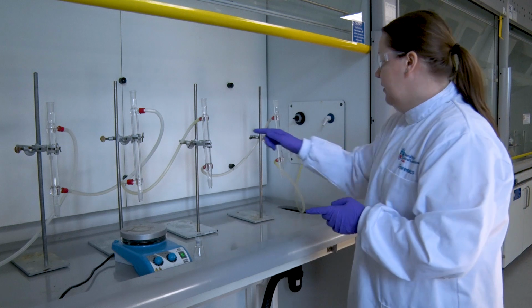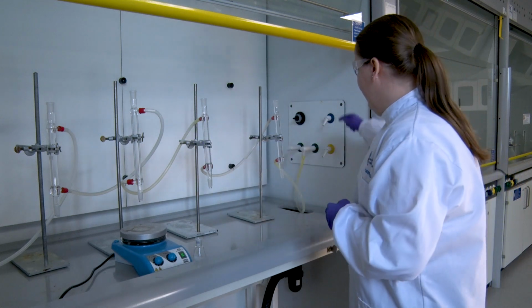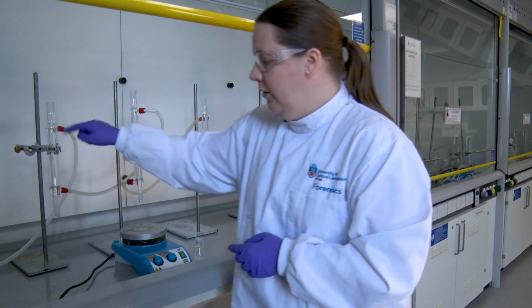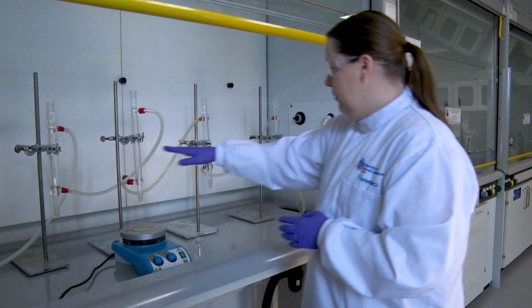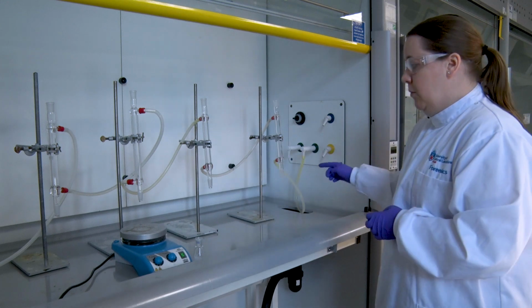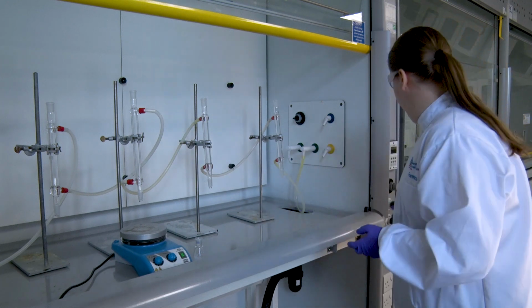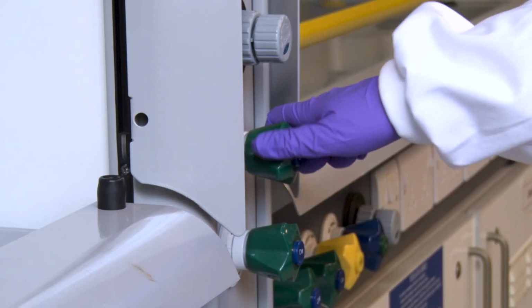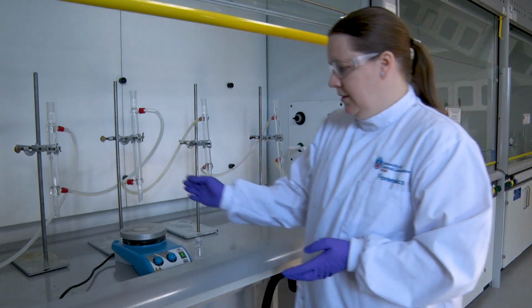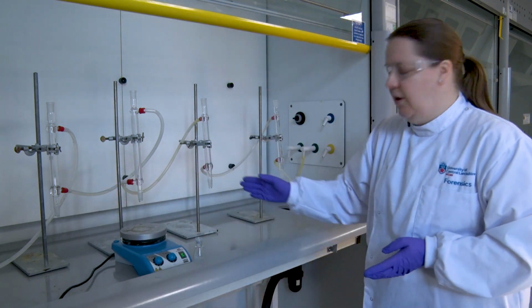Okay, so the reflux condensers are set up in daisy chain, and that means that water comes from the tap and it's going to feed through all of them before it goes to the outflow. Don't touch any of the connectors. If the water's not on, which it isn't at the moment, either me or a demonstrator will turn it on. I'm just going to turn it on so you can see the flow. As I say, this will either be on or we'll turn it on, and you'll be able to see the outflow of the water and it flowing through.